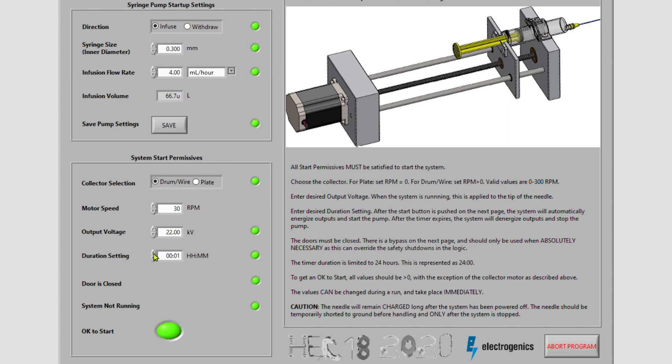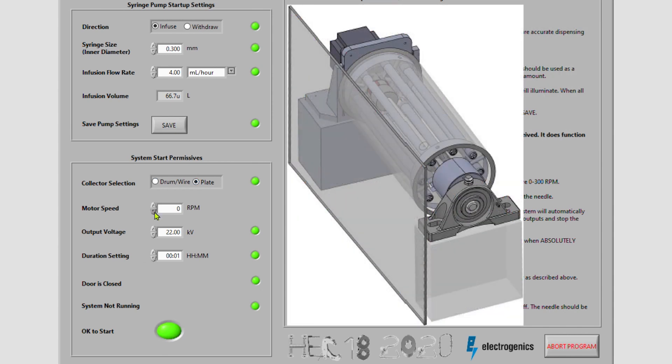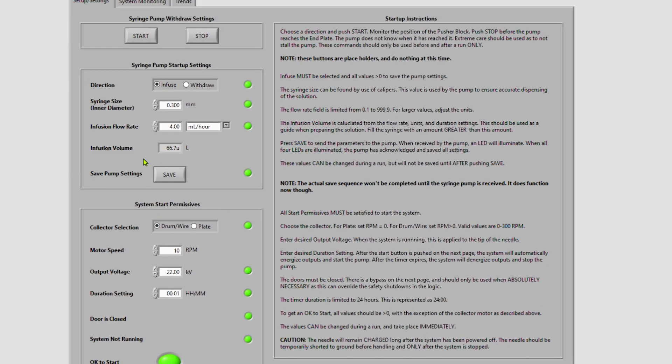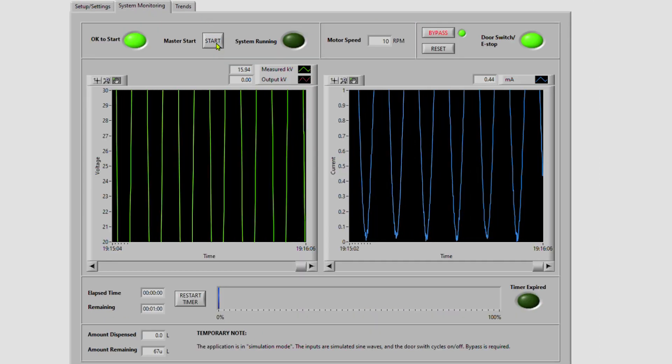If we adjust the experiment duration, the calculation for the infusion volume changes. If we wish to use the plate collector, we must turn off the motor. With all the permissives set, we have an OK to start. Press the start button to begin your experiment.